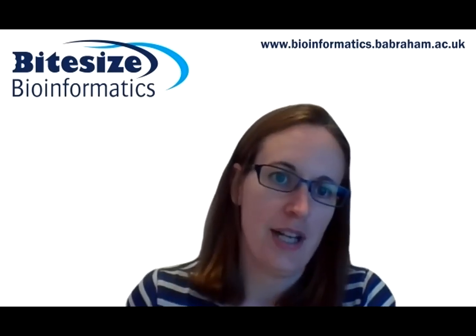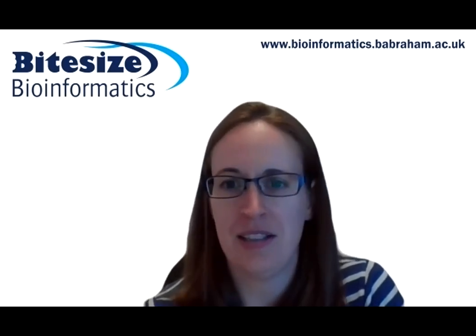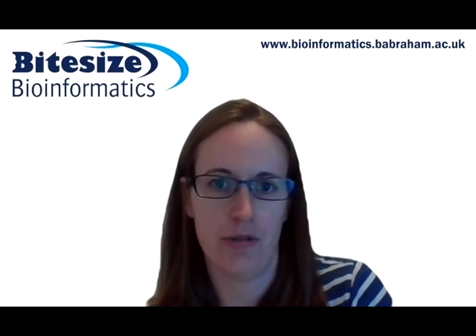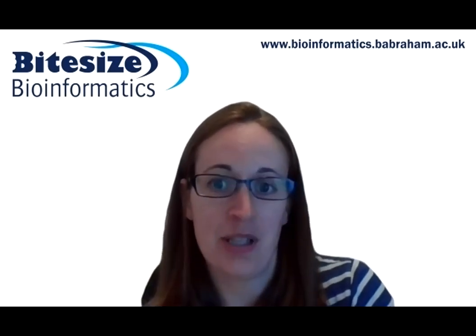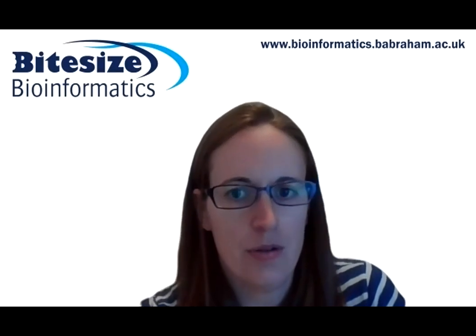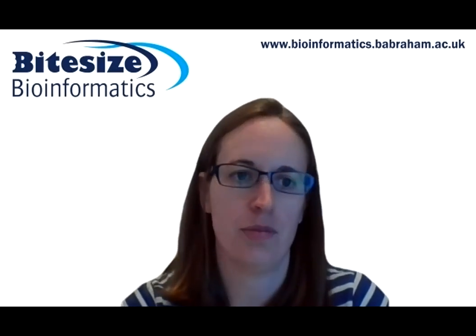So functional analysis on gene sets is a very popular thing to do. Often at the end of an analysis, when all the data has been processed, it can be a really useful thing to do to help interpret results from experiments, hopefully neatly tying up experimental results and perhaps giving suggestions for future work.